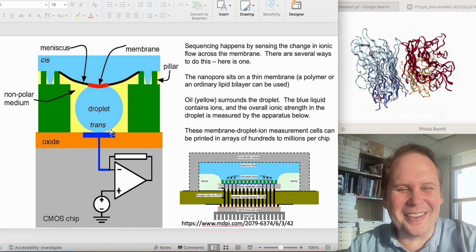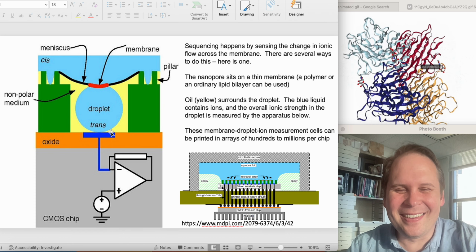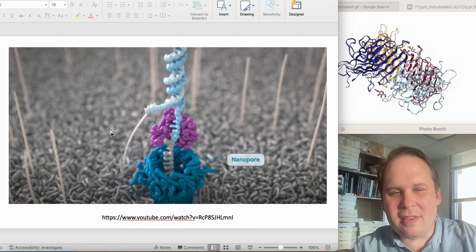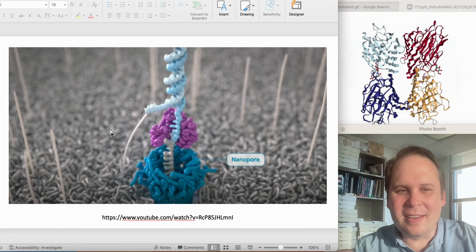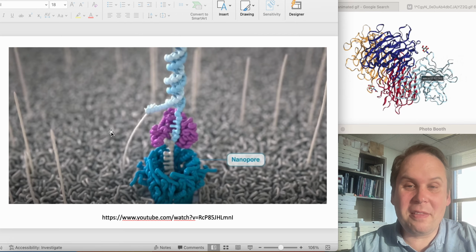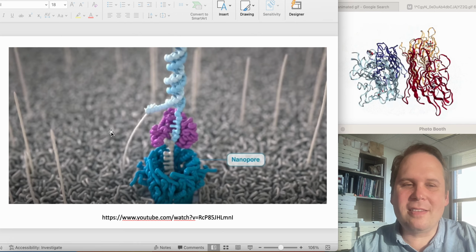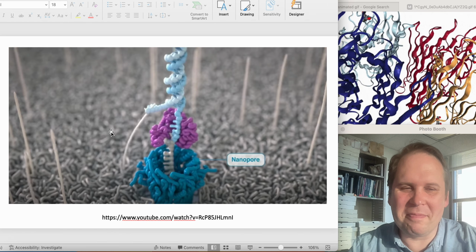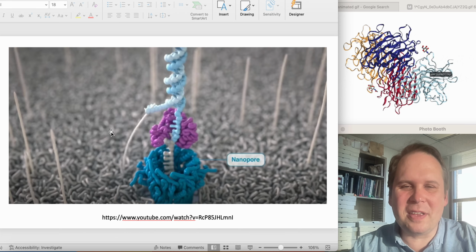We've done all the hard work here. So there you go, nanopore sequencing. Now, if you watch or rewatch the video, it's going to make a lot more sense, I think. But you just slurp a bit of DNA through a tube. And there are lots of little refinements on this that each of the companies use, but the main technique, that's all you got to get.